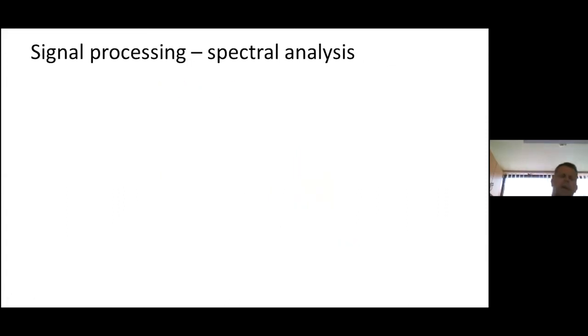In the short video, at the end of the video, you've seen that my colleague very quickly recorded an NMR spectrum of protons, which have a strong signal. And the first thing that we get directly from the measurement is a so-called time domain signal.